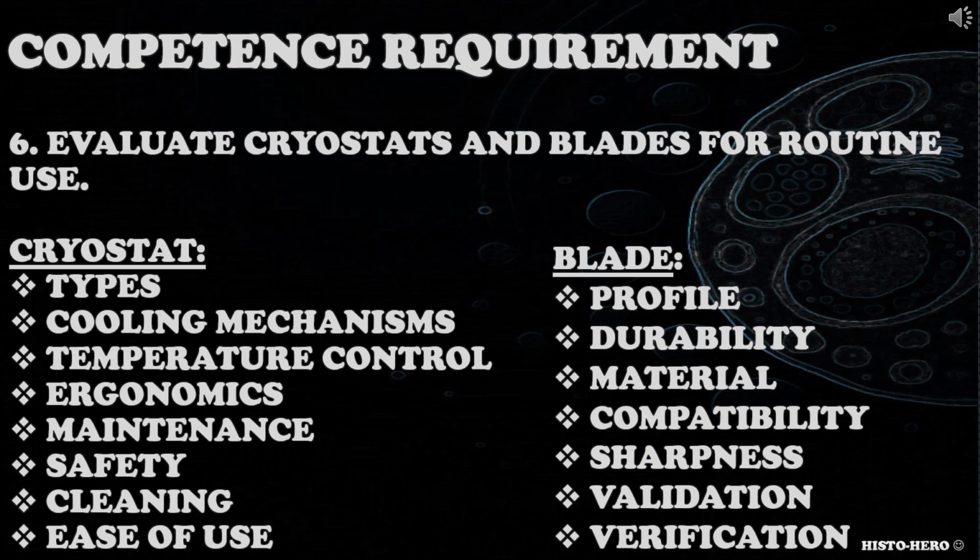When addressing this competence requirement, candidate could consider type of cryostats used, cooling mechanisms, temperature control, precision, consistency, ergonomics, safety, ease of use, quality, regular maintenance, sample compatibility. As for blades, candidate could consider profile, durability, material, sharpness, compatibility, validation, verification.